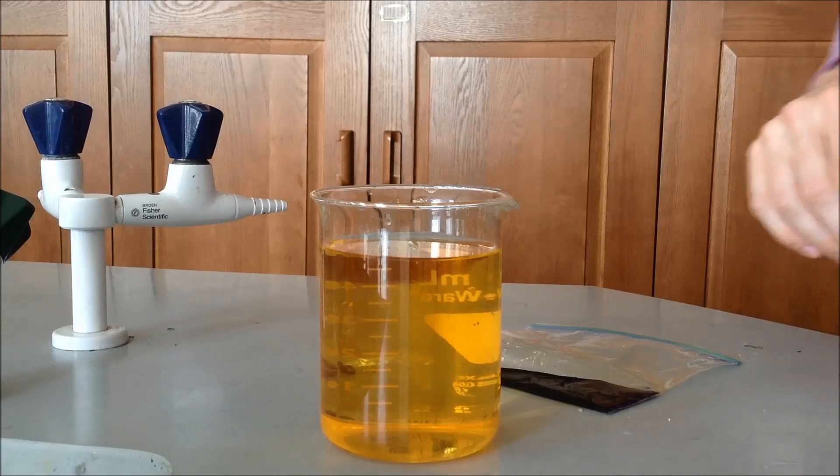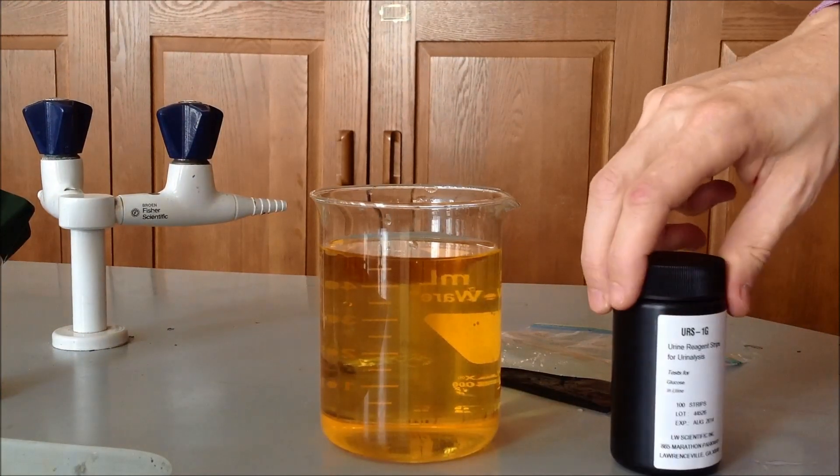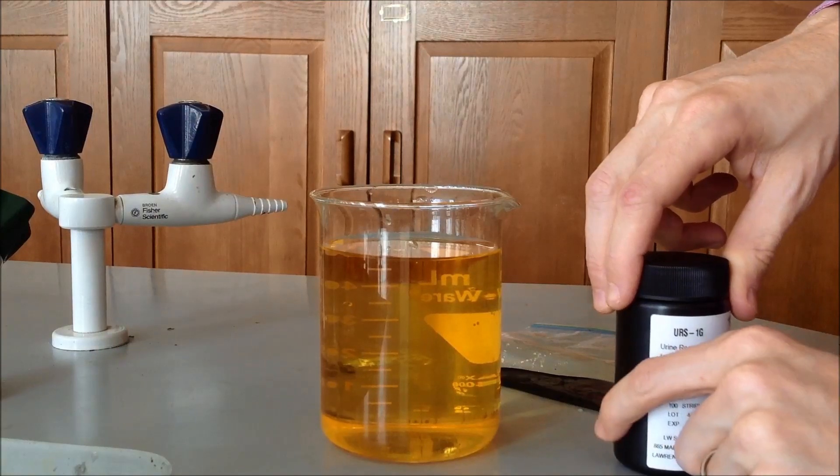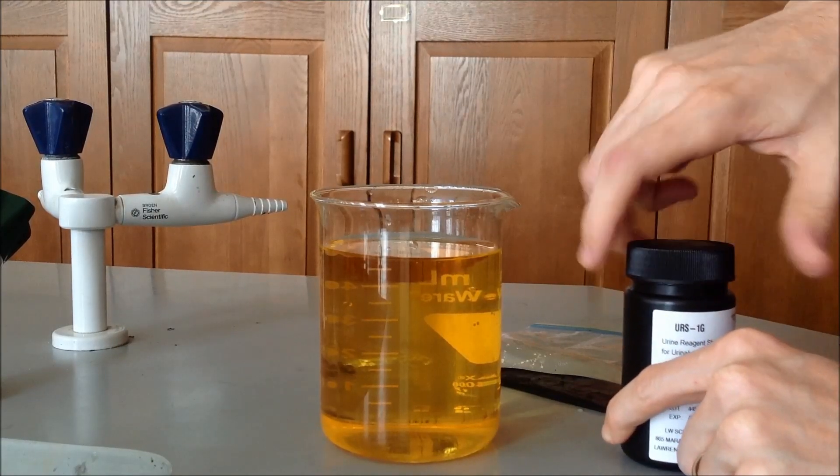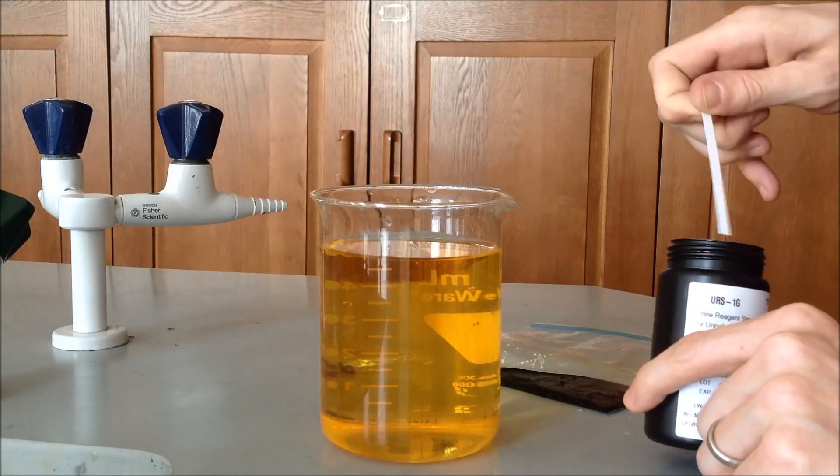And then we will also do the glucose tests with the glucose testing strips. So we'll just take one of these things out, show you the initial color. We'll dip it into the beaker solution and then let it rest for a second and we'll look at the color.